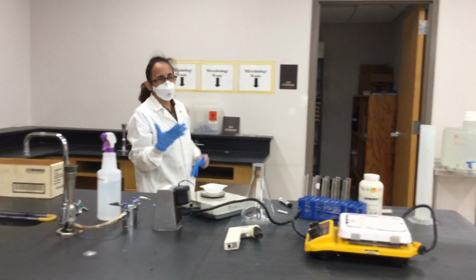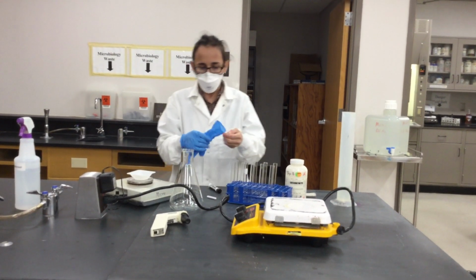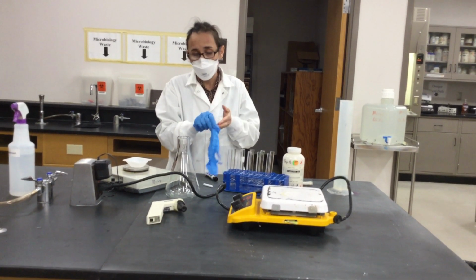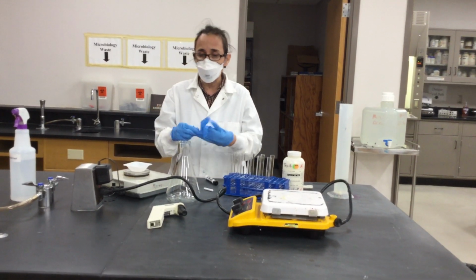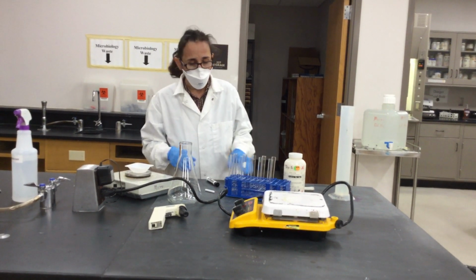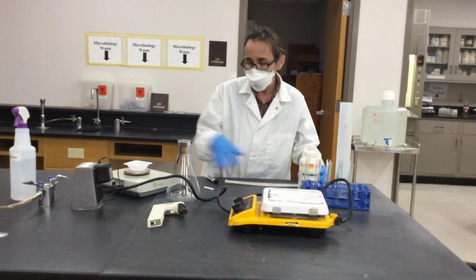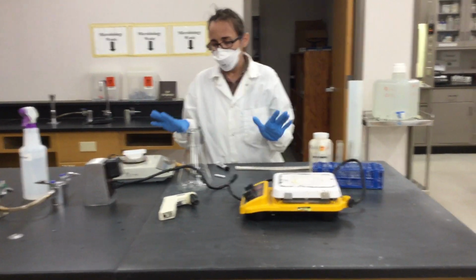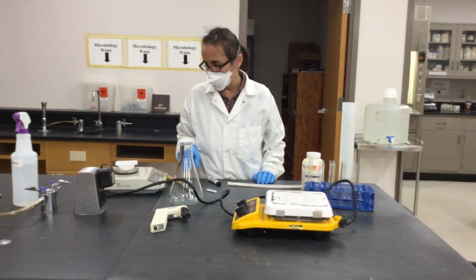In this case, you don't require, for now, to have a sterile area because this media, as you're preparing, is not sterile. So you don't need to have your Bunsen burner on or your aseptic technique in here. So we will have the following material to prepare media.